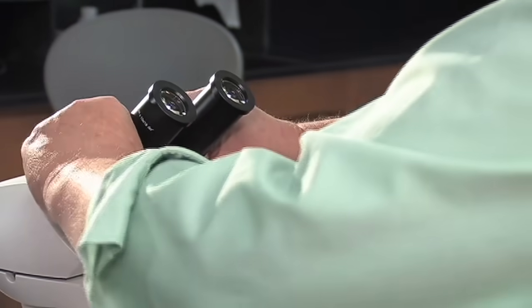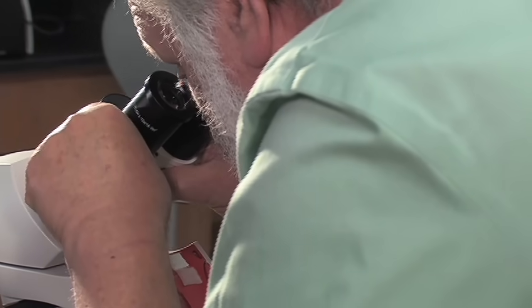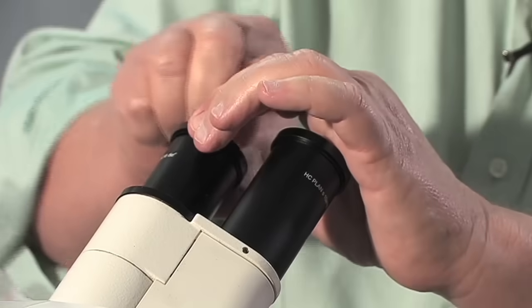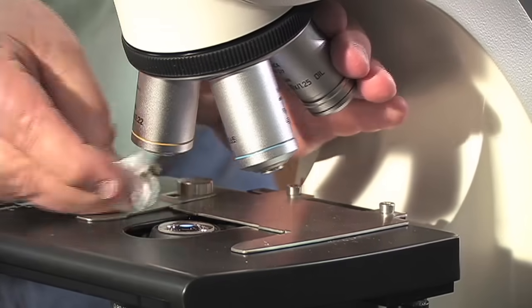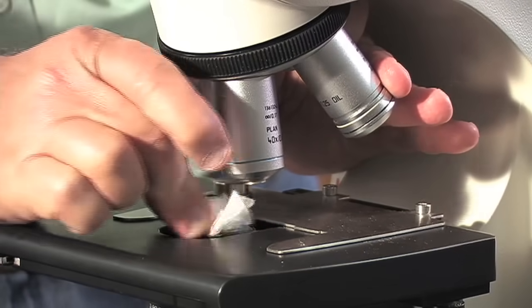The eyepieces are adjustable. When you look through the microscope, you want to adjust them so that they only form a single image. Before you use your microscope, you want to clean all the lenses. We're going to use a little bit of lens paper — just take one sheet, tear it out of the booklet, and wad it up. Use that sheet to clean each of the eyepieces and each of the objective lenses. I also like to go ahead and clean the top of the diaphragm.